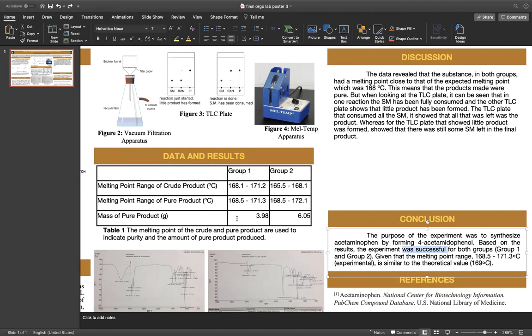Oh, so it's like a comparison. Yeah, or if you didn't want to post the reference spectra, the actual image of it, do include it within the table at least. Right, so when we're looking at the table, we can compare the spectra of the actual data and those wave numbers to the one of a reference spectrum.